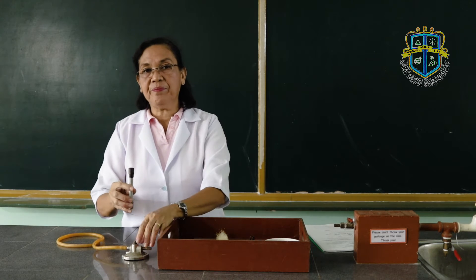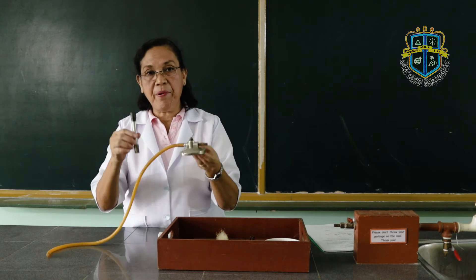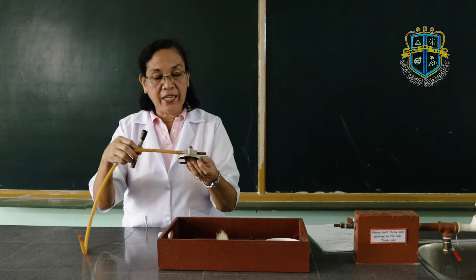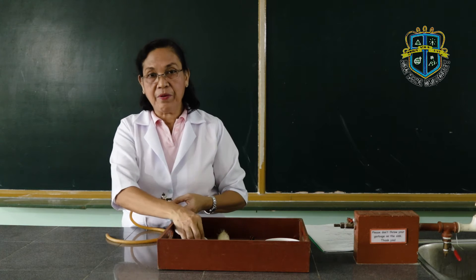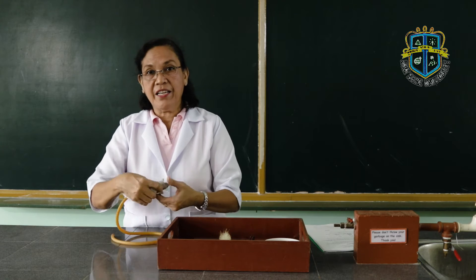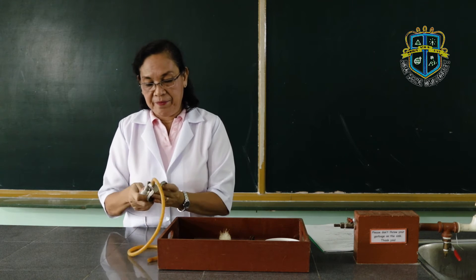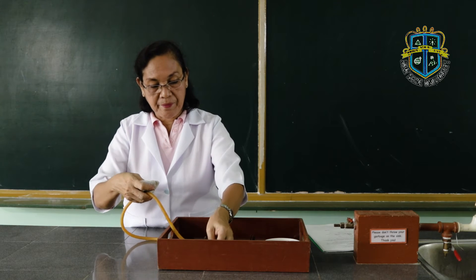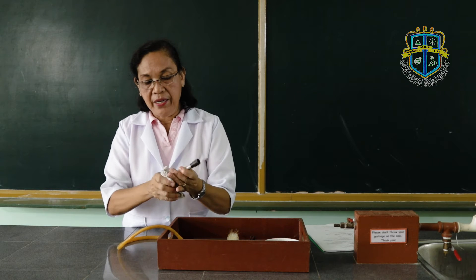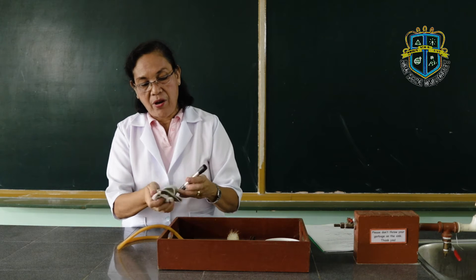Once you have learned the parts of the Bunsen burner, let us try to clean each part. Clean the base, then clean the barrel as well as the collar.